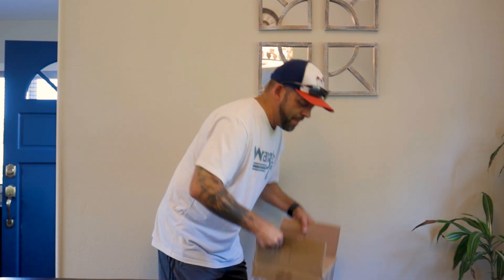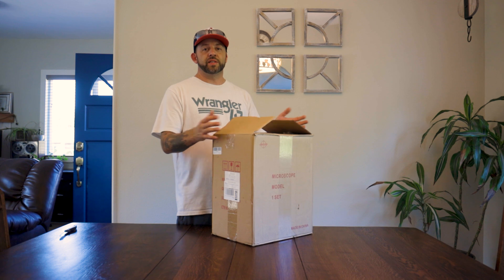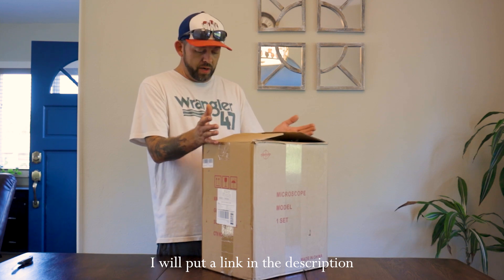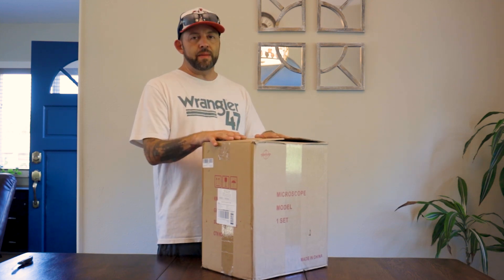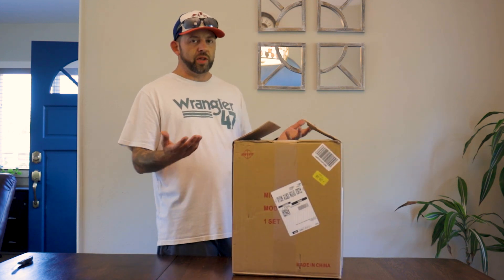Today I just got a package that showed up on my doorstep and I'm pretty excited because this is a new microscope. This is a great microscope to learn to start with. I ordered this off Amazon. It is a research grade compound microscope — this is the Swift 380B. Today I'm gonna do a little unboxing and pull this all out and have a look at it.